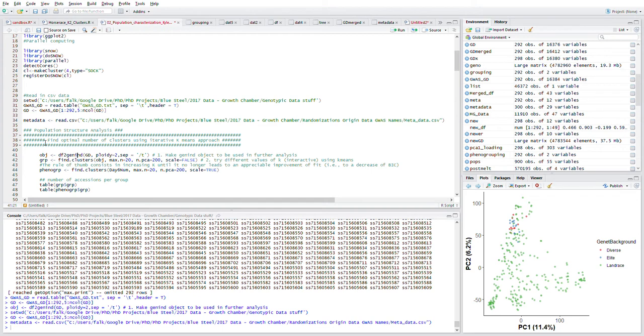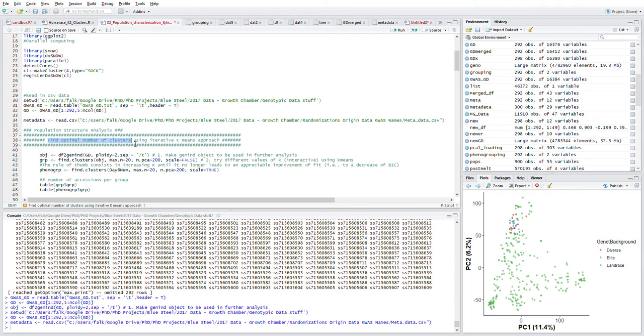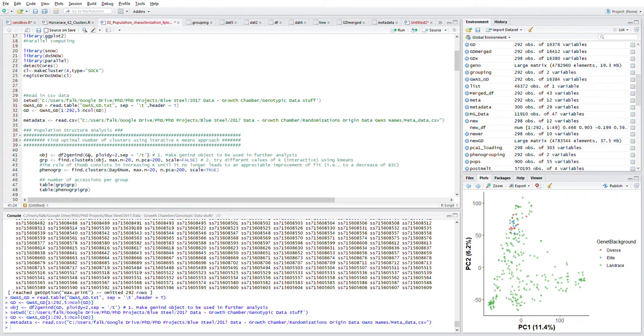Next we step into finding the optimal number of clusters using the iterative k-means approach. We have our genotypic data here, and we rerun this approach. I'm not going to run it right now because it takes some time.